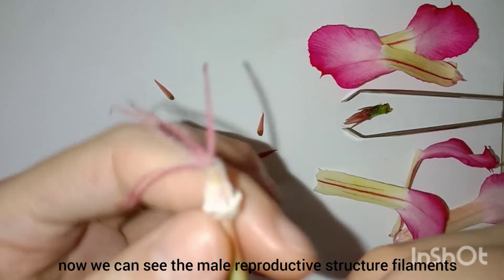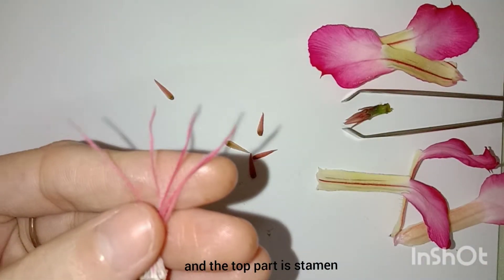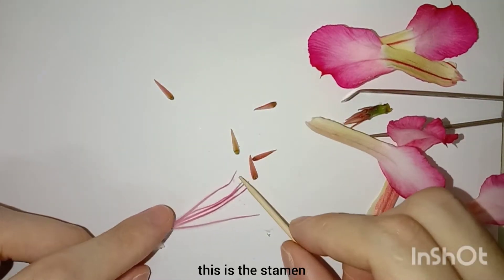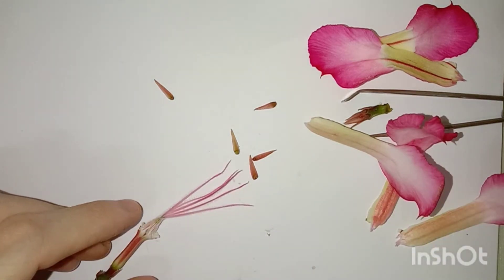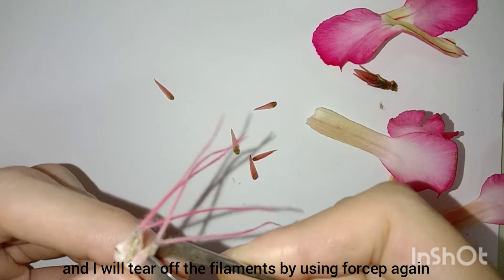Now we can see the male reproductive structure filaments, and the top part is the stamen. This is the stamen. And I will tear off the filaments by using the forcep again.